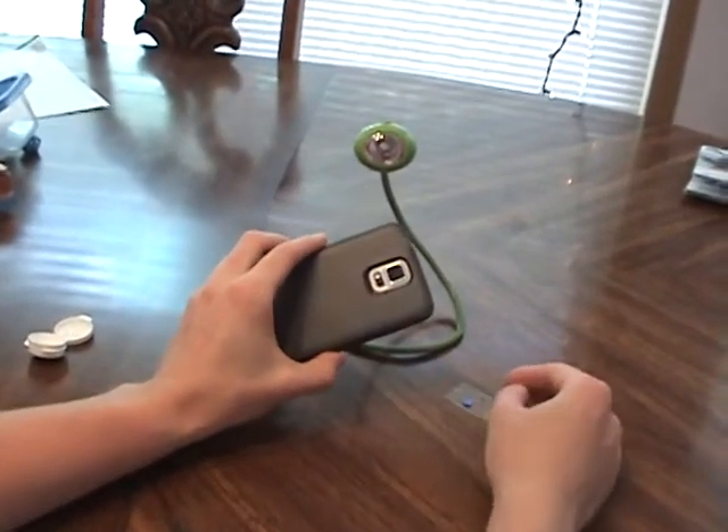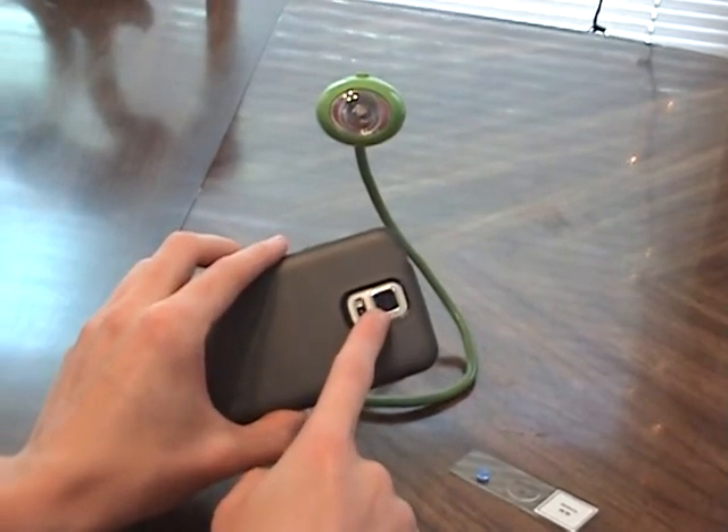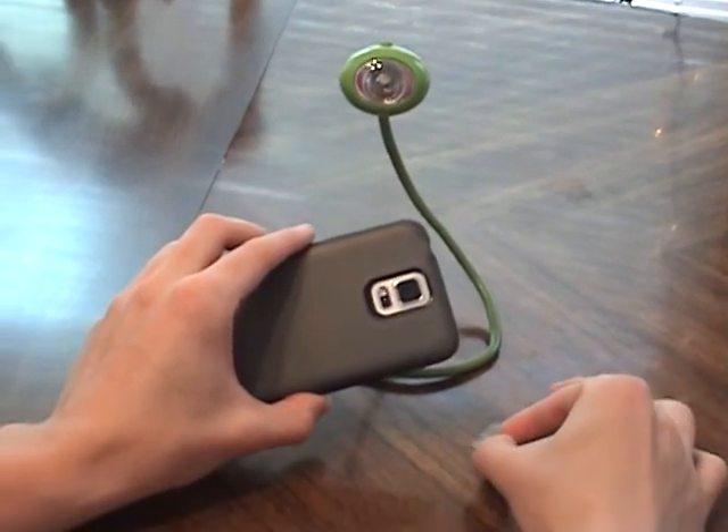Alright, so several Kickstarter backers have requested seeing a demonstration using the microscope lens with the phone's main camera. So that's what this video will be about.